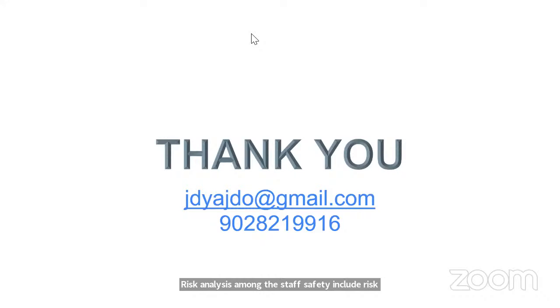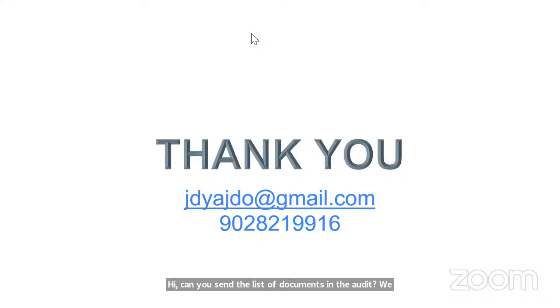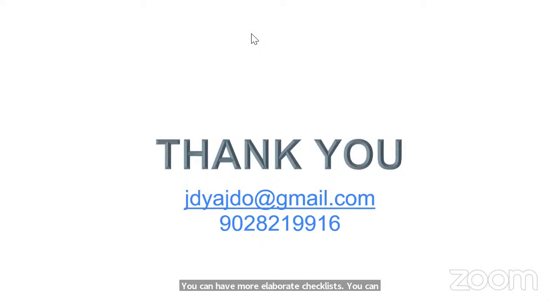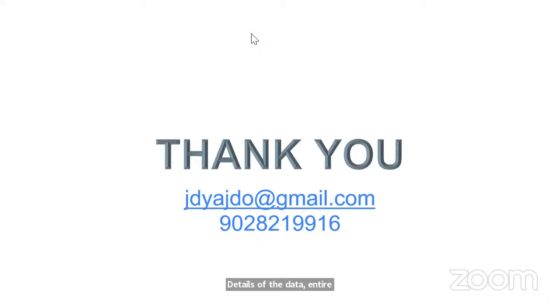Can you send the list of documents in the audit? We have already included the sample checklist here. As I have mentioned, it includes all the aspects of your technical checklist. You can have a more elaborate checklist. You can have a detailed look into other checklists which are available for making a comprehensive checklist of your laboratory. A number of parameters tested for such a long time without any revision may also indicate that not enough attention has been paid to look into these results. Okay, very good.